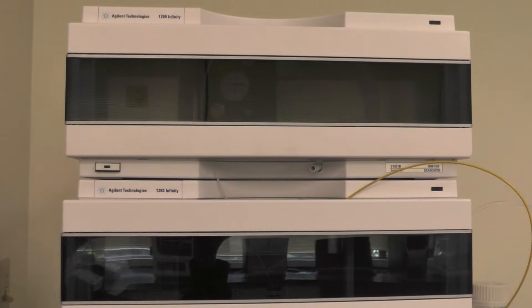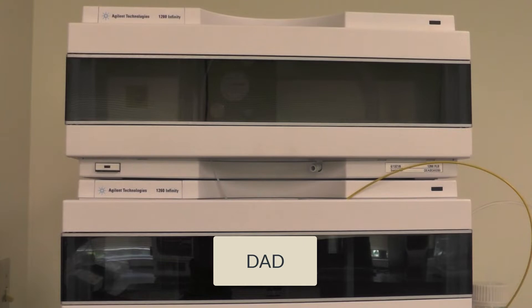The detector generates signals from compounds as they elute from the column. In our facility, there are two types of detectors available: a UV visible light detector DAD and a fluorescence detector FLD. You may only choose one detector for your analysis at a time. In this video, we will use the DAD detector.